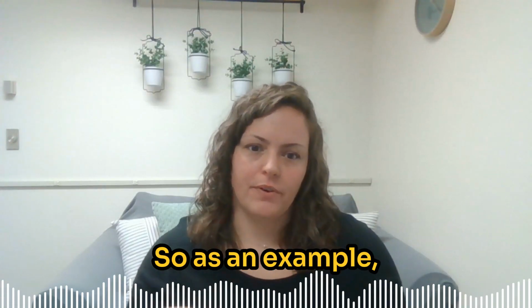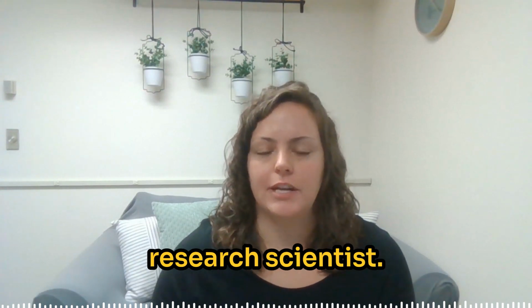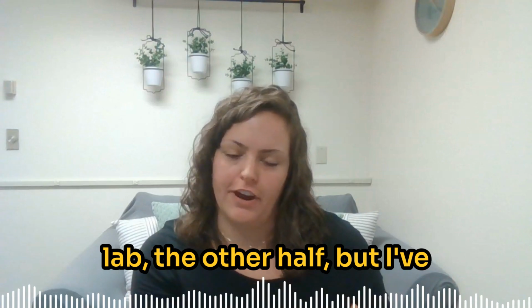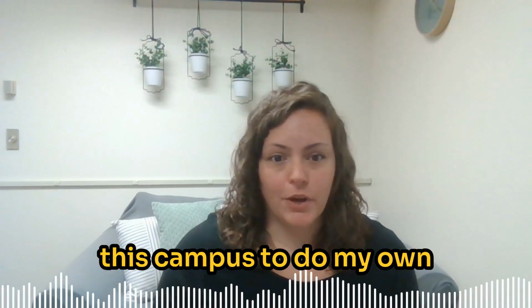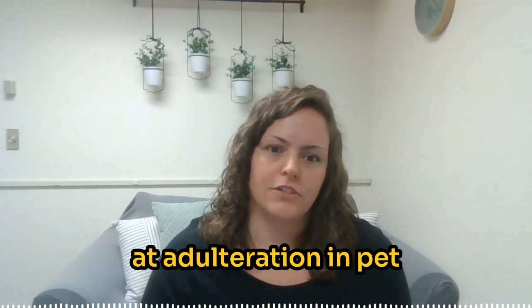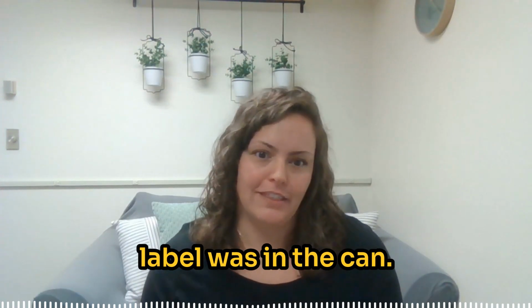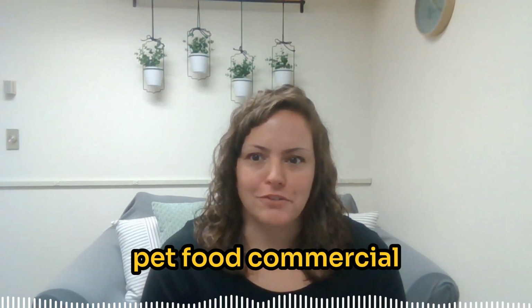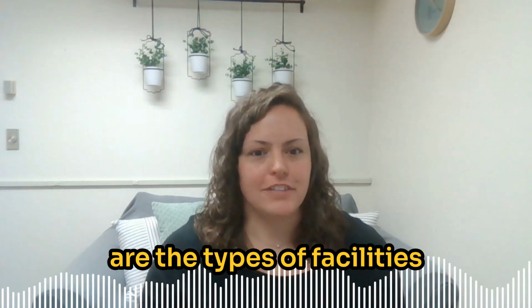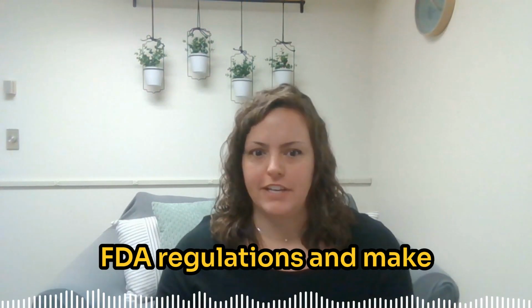So as an example, half of my job here at the university is actually as a mercury research scientist, and I'm director of the core lab, the other half. But I've leveraged our core labs on this campus to do my own independent research. And so we were looking at adulteration in pet food products, to make sure that what is actually on the ingredient label was in the can. And we found out that there was quite a bit of adulteration in the pet food commercial industry, which is really disappointing. But these are the types of facilities that can assist with that type of analysis to look at FDA regulations and make sure they're being met.